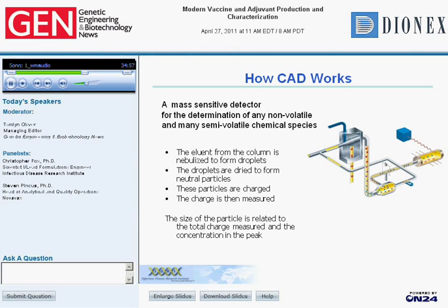So in the next slide, let's talk about what is charged aerosol detection, or CAD. It's a mass-sensitive detector for non-volatile and semi-volatile compounds. The detection process includes nebulization of the HPLC column eluent through nitrogen gas, whose inlet is shown there on the right in the figure. And this is followed by evaporation of the mobile phase solvent through a drying tube. Now, a secondary stream of nitrogen gas is charged by passing a high-voltage corona needle. The generated ions then collide with the analyte particles in the mixing chamber, where the now charged particles pass through to the collector, where charge is measured by an electrometer. One of the key advantages for us is that the CAD detection mechanism does not require chromophores for molecules to be detected.